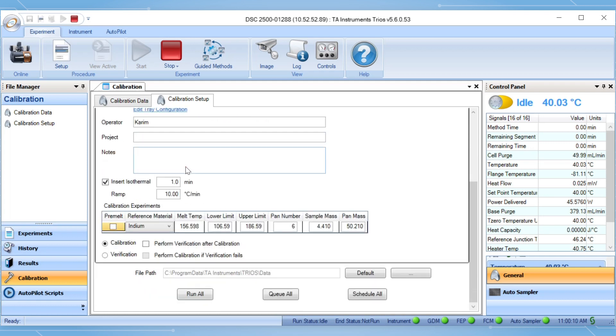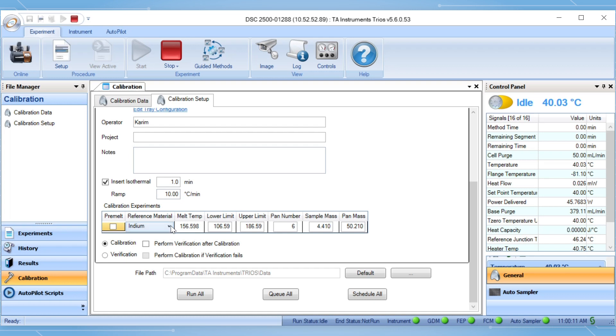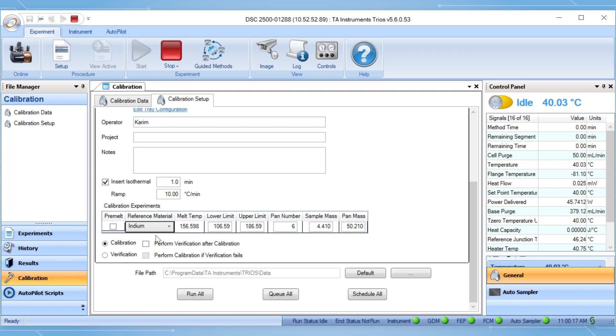You can select the standard you are using in the calibration from the drop down menu. Here we're using indium. Then input the sample mass and the pan mass if you are using T4P heat flow mode. If using an auto sampler, you can input the sample pan location.